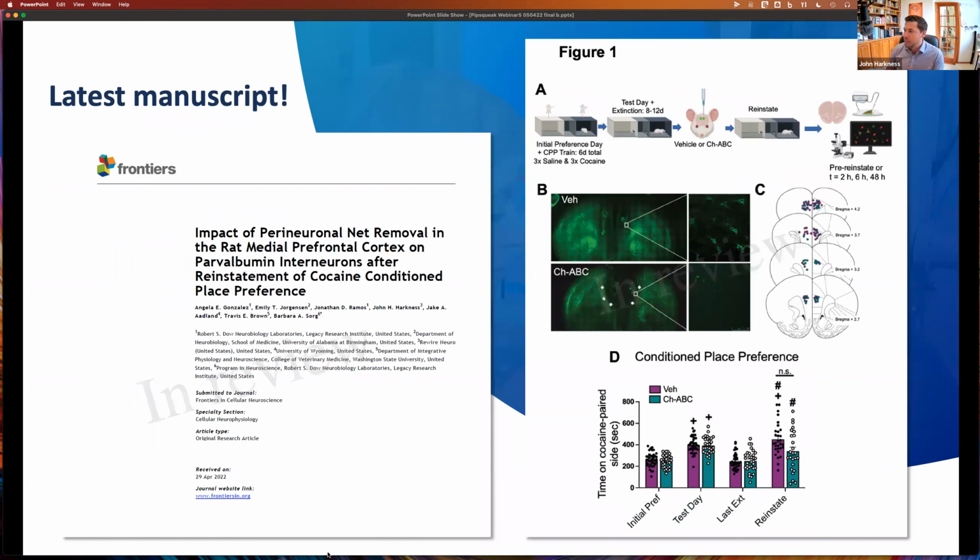So the types of analyses that it was really designed to excel at were looking at fluorescence or immunohistochemical imaging, staining coming off of a confocal, a bright field, or a fluorescence microscope. And in the workflows that we were doing, and as I'm showing you here, a publication that just went out on Friday, so this is just in review right now, the types of workflows that we were looking at were really post behavior, where we're looking at a slice of tissue. Our stuff was often brain tissue, but the software is not tissue specific, it's tissue agnostic. And so, we were going in and staining different proteins, looking at how they interacted in different brain regions.